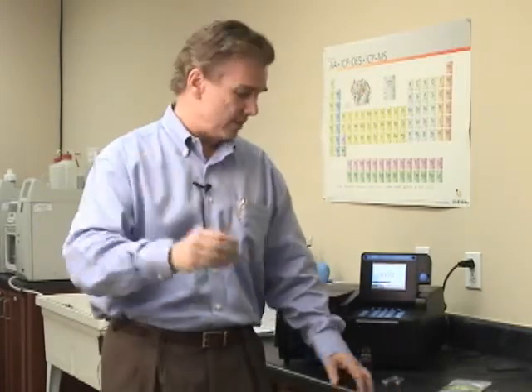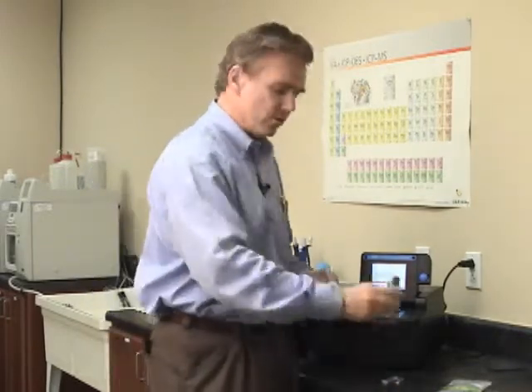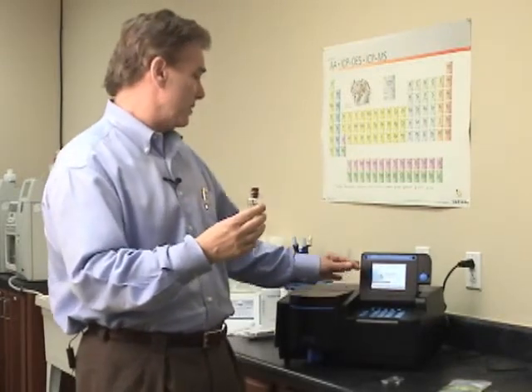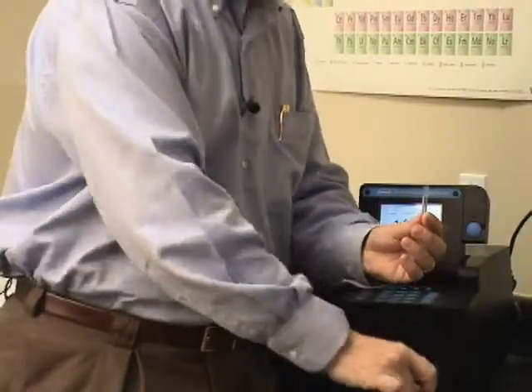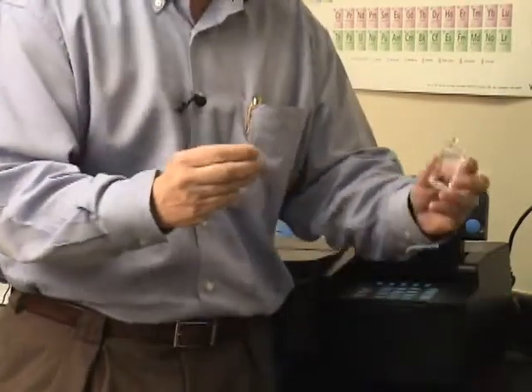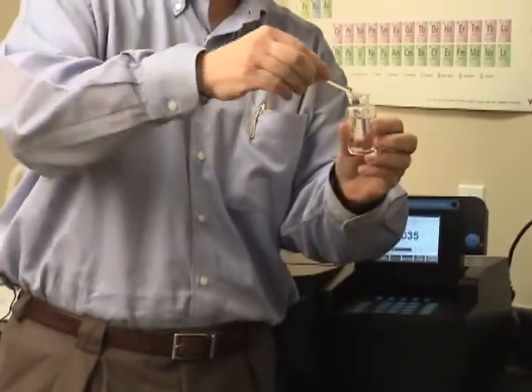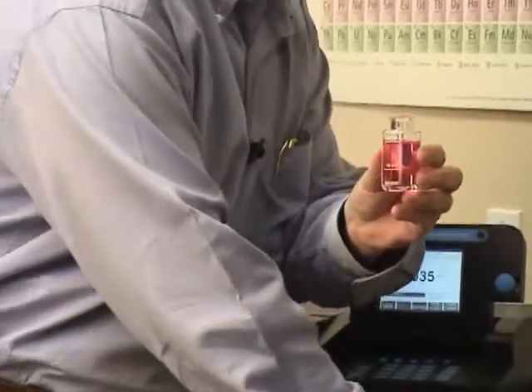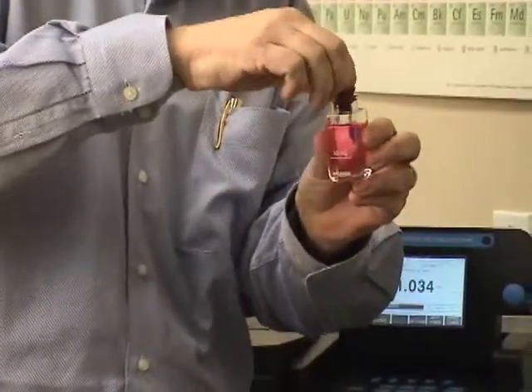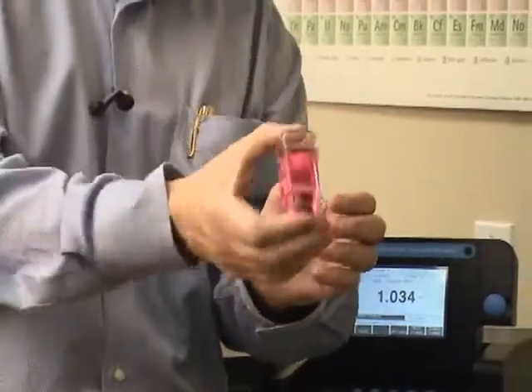It's very easy to use. You shake the material to the bottom of the tube, just like a sugar packet or a ketchup packet. Then take your cuvette — this is a 25 mil cuvette for a Hach DR-4000. I've already put the DPD reagent in here, so all we have to do is add the standard. You snip off the top of the tube, invert it over the cuvette, squeeze the bottom, and the solution releases directly in. Tap it once to get the residual, and you can see the reaction is already starting.